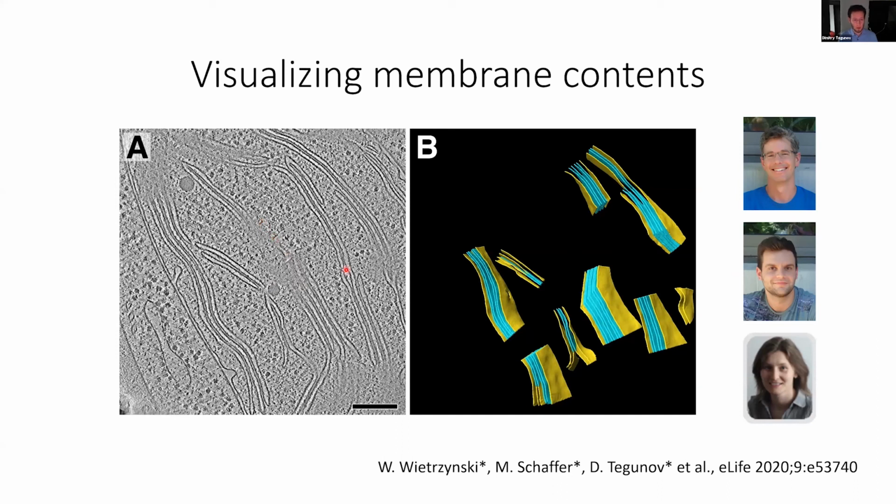Those membranes are not perfectly flat, so you cannot really find an angle inside this volume where you can just put a 2D plane through the volume and look exactly at the membrane as it lies flat in the image plane.